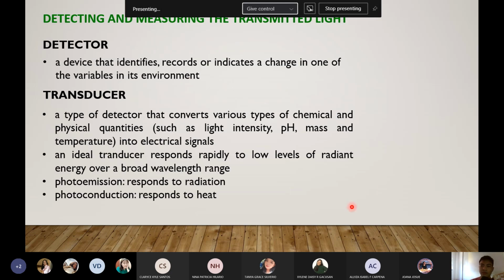And yan. So asan na tayo? So we discussed the light source. Okay, so alam na natin yung mga light source. We have the tungsten halogen, no? The hollow cathode lamp, no? We have the deuterium, we have the mercury vapor, no? So tapos sa wavelength selector, na-discuss natin yung mga monochromators, no? Yung mga gratings, no? Okay, so basically prism lang sila, pero maliliit na prism, no.